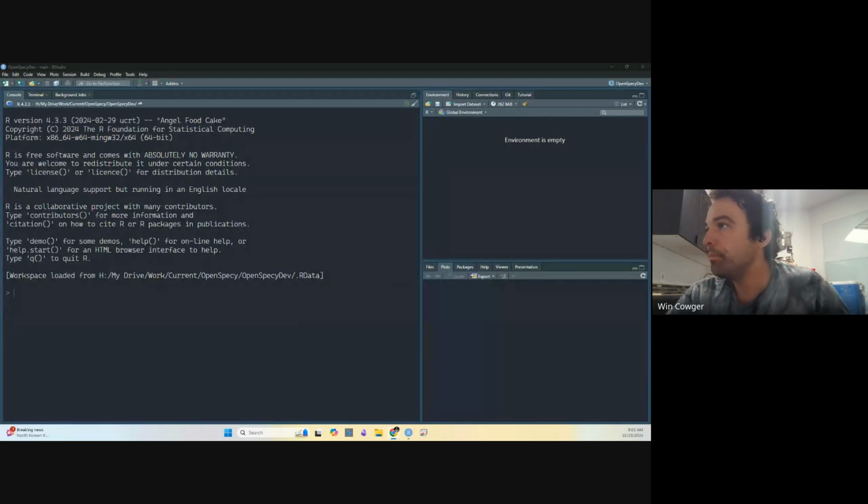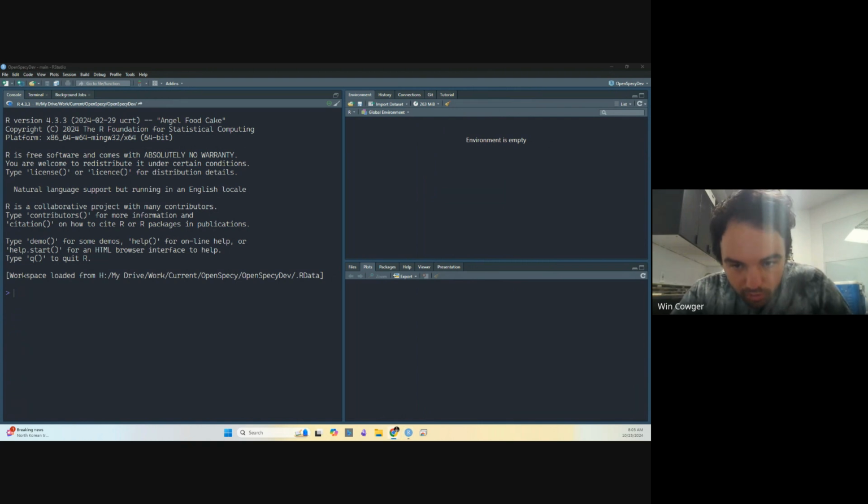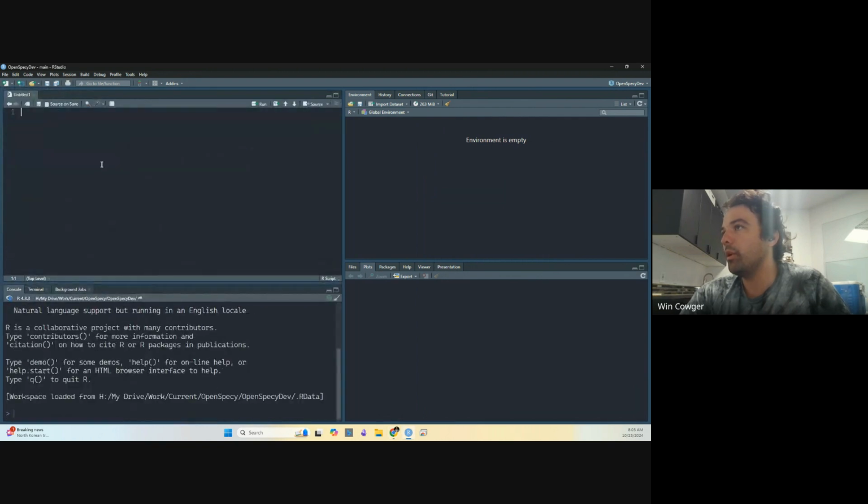All right. So I'd like everybody to open up RStudio. Just to give people a little bit of background about RStudio, you have these different components in here. You can create a new file, a new R script. We're going to just work in a plain R script, and we're going to go from scratch and build out our analysis pipeline.